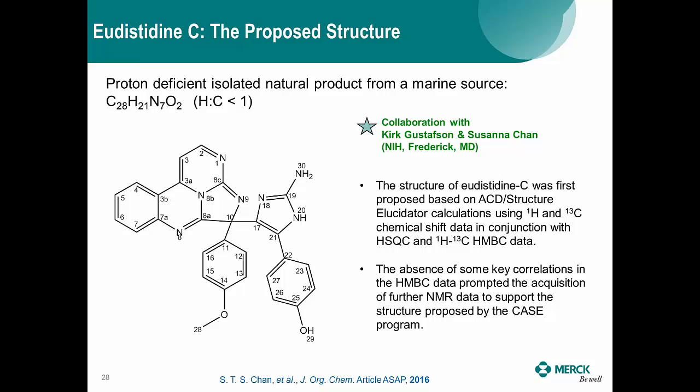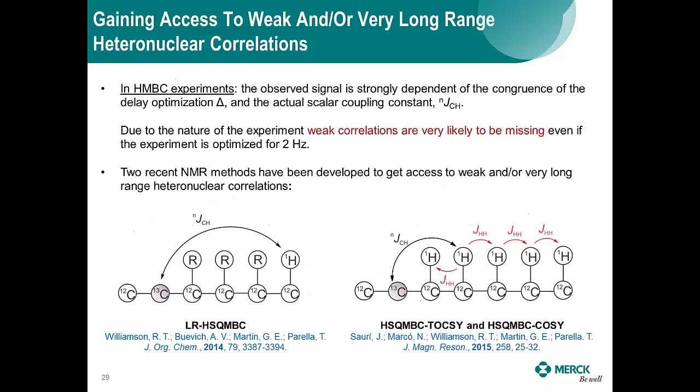So we were not very confident about the structure, and we were not able to get any correlation from these two phenyl moieties at the bottom of the structure in any HMBC experiment. So basically, here I want to introduce the experiments that we developed in collaboration, in this case with Teo Parella from the Autonomous University of Barcelona in Catalonia.